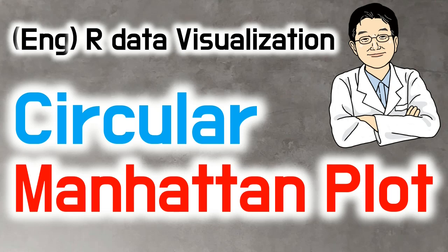Our data visualization. Today I'm going to talk about circular Manhattan plot. It is a kind of Manhattan plot and it is a little beautiful and newly developed, but basically it can show the same information as Manhattan plot does.